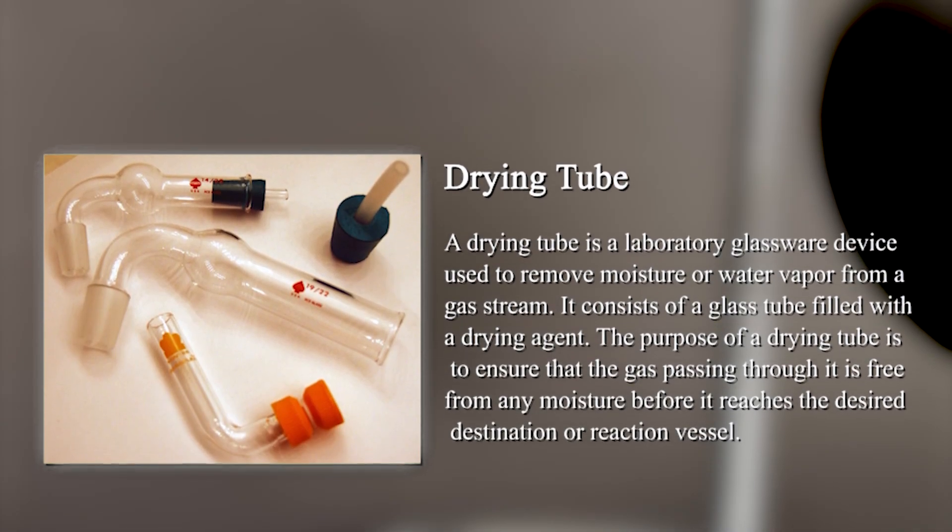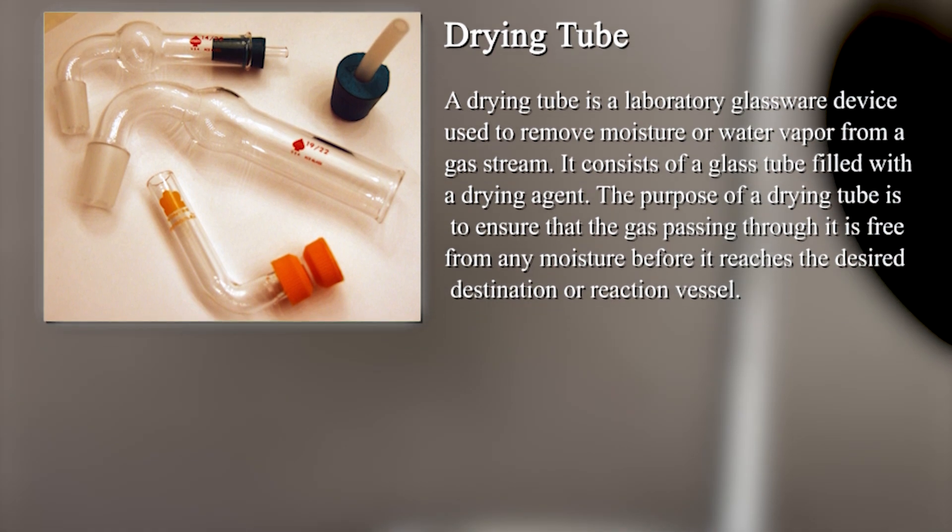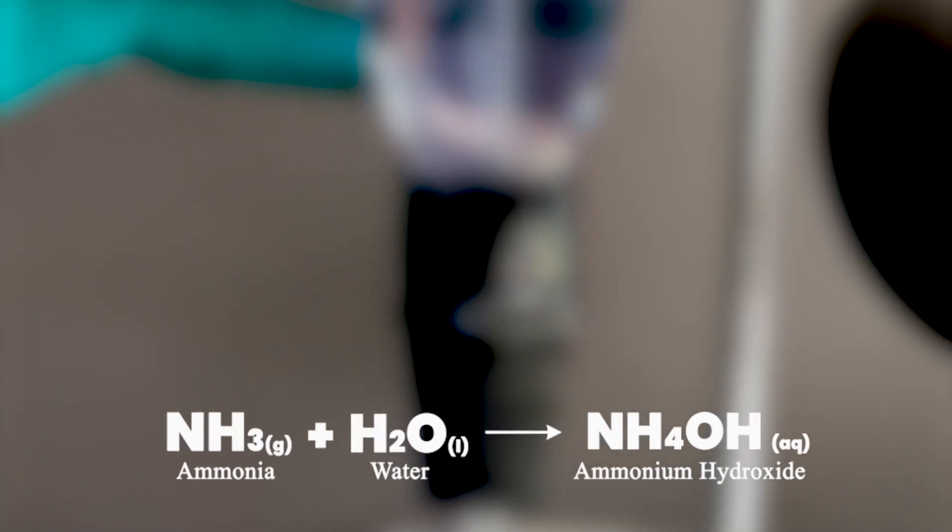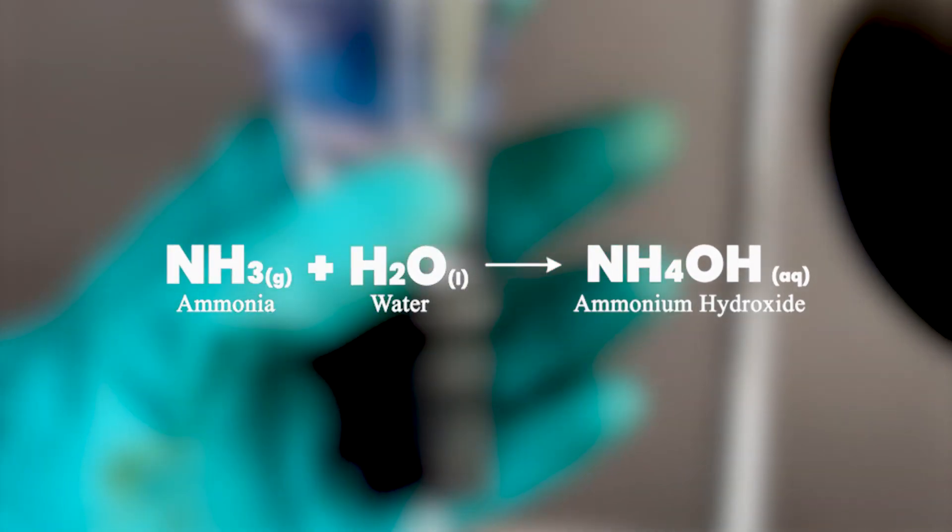After doing a bit more research, I decided to add a drying tube into the setup. I concluded another reason why the fountain was unable to flourish was due to the presence of water moisture in the Erlenmeyer flask, which reacted to the ammonia present to revert back to ammonium hydroxide.